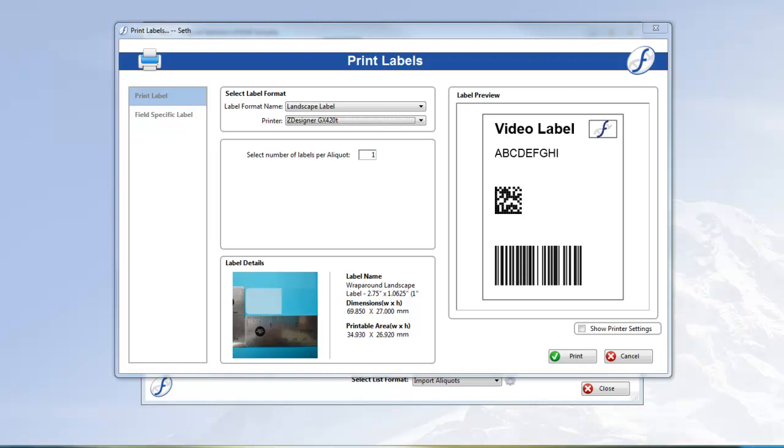With FreezeWorks, you can create as many different label formats as your organization requires, and assign them to the appropriate groups to streamline everyone's separate workflows.